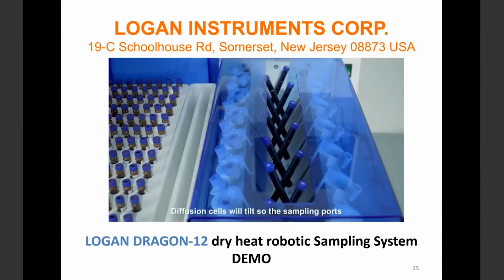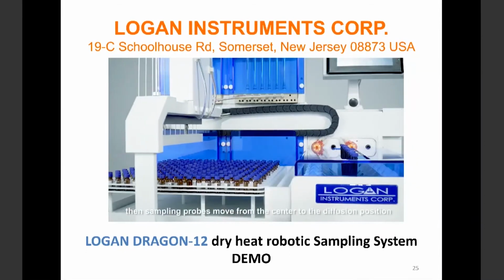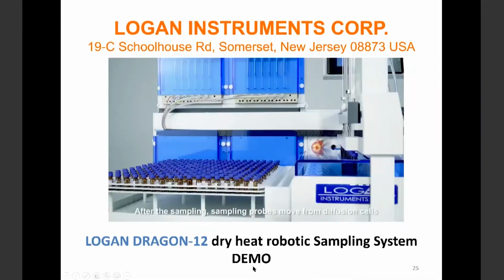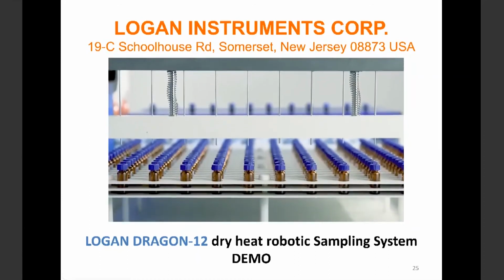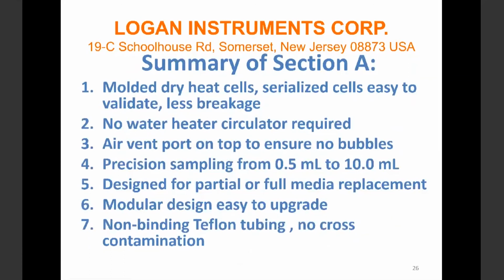So here we are, playing again. You tilt the cell, it goes there, takes the sample, and puts it into the vials. So this section completes the dry heat system.